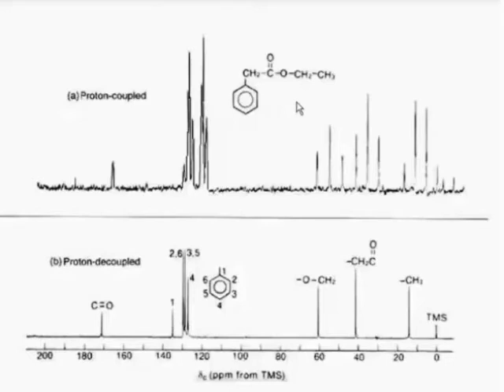And as a result, the spectrum is rather complicated looking. Now, for example, the C13 of this methyl group has its signal split by the 3 neighboring hydrogens that are directly bonded to it. Remember the n+1 rule. The C13 signal is split into a quartet right here.